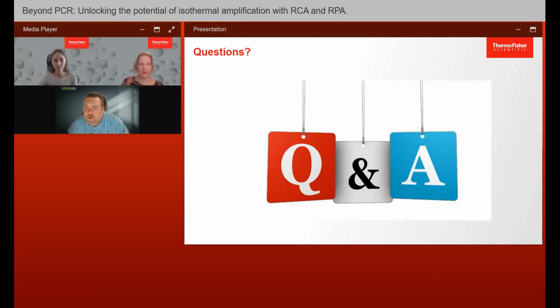All right. Another one for you, Rasa. What is the preferred technique for the pathogen detection, LAMP or RPA? And what conditions should be considered when choosing between the two? Both are widely used and very efficient for detection. For LAMP, as I already mentioned, you need 6 primers. So LAMP assays are more difficult to design, and for some pathogens, maybe it's complicated and you need some bioinformatics analysis for LAMP.